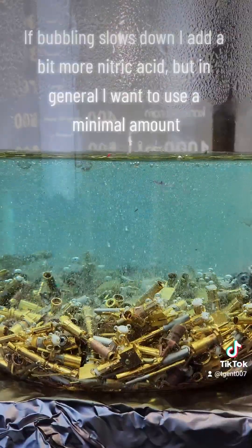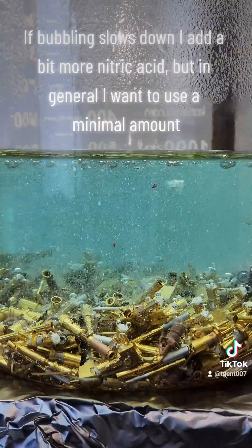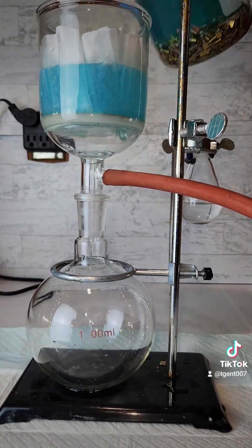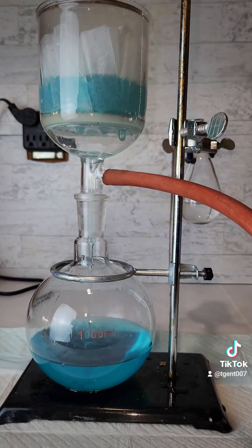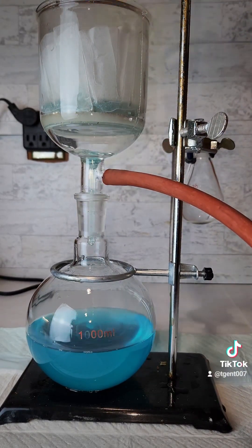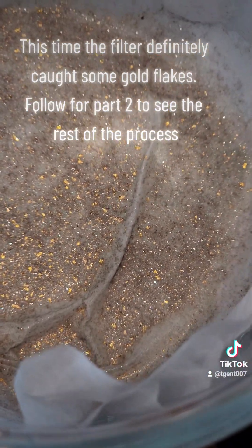If bubbling slows down, I add a bit more nitric acid, but in general I want to use a minimal amount. Eventually the reaction stops and I wash them again the same way I did before. This time, the filter definitely caught some gold flakes.